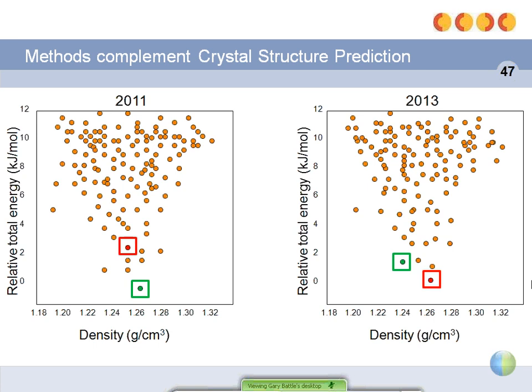So a prudent approach might be to combine these types of calculations with the solid form informatics approaches which we've described today. As an aside to this, I would encourage you to look out for the results from the latest blind test of crystal structure prediction hosted by the CCDC, which are about to be published in Acta Cryst.